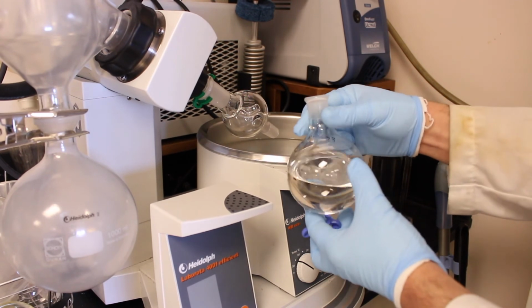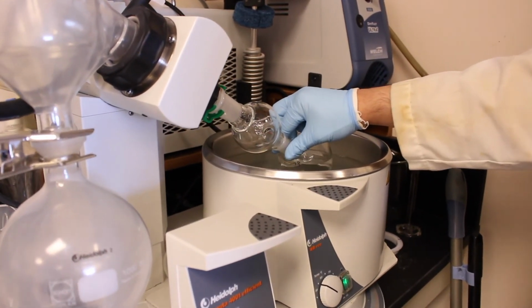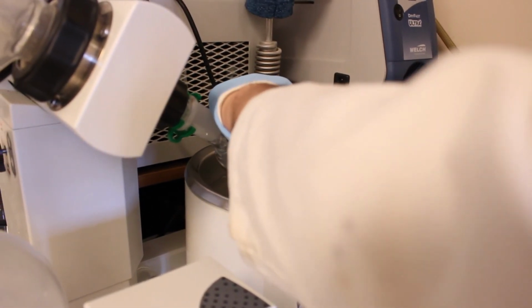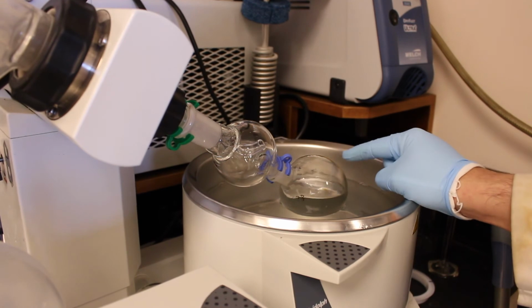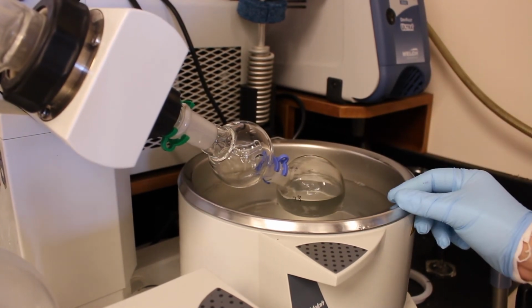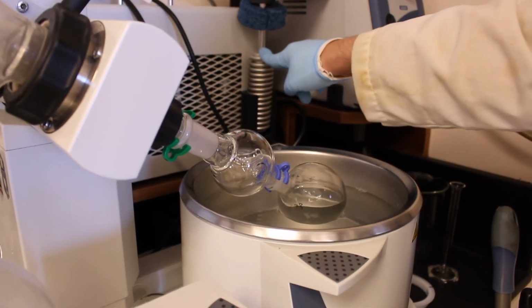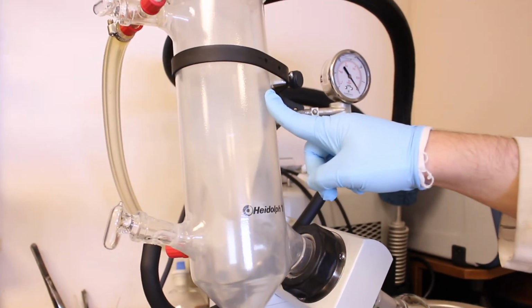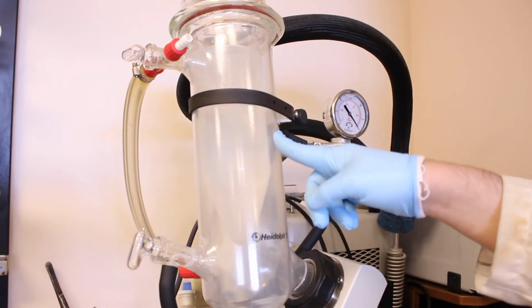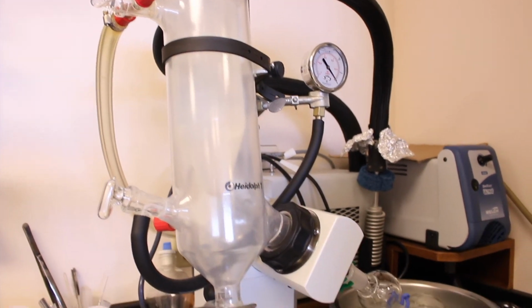Alright, so we've got our flask, and we're going to put it onto the rotovap. Okay, and we'll put a blue Keck clip to make sure it doesn't fall into the water bath. That's a very common problem, in which case you pretty much lose all your product, which is a shame. The chiller, you can see I've taken out of the chiller because when it's on it's kind of loud, so I've just filled the condenser with very cold acetone. So it functions the same. It's just a very cold surface for the solvent to condense on.